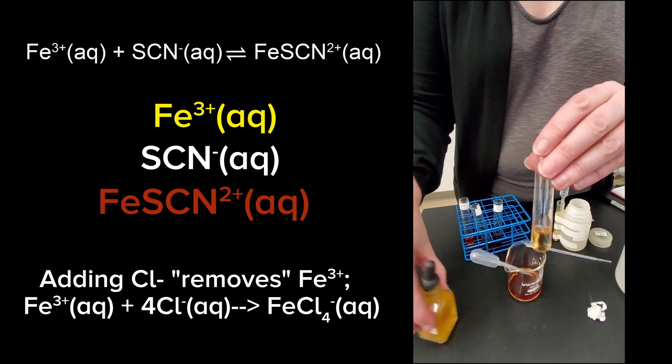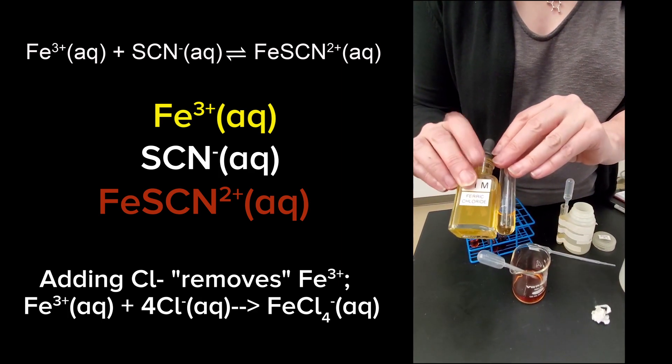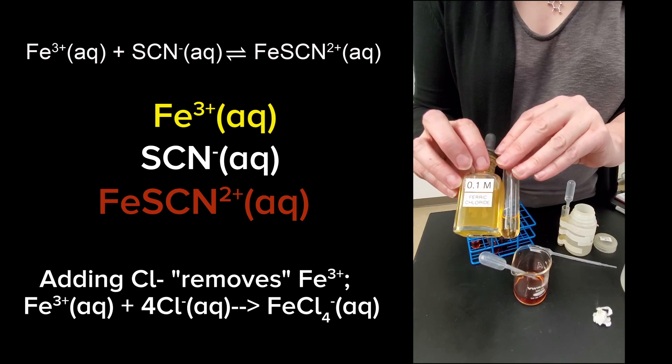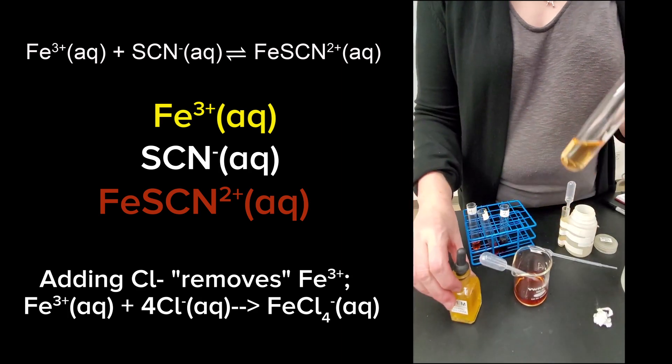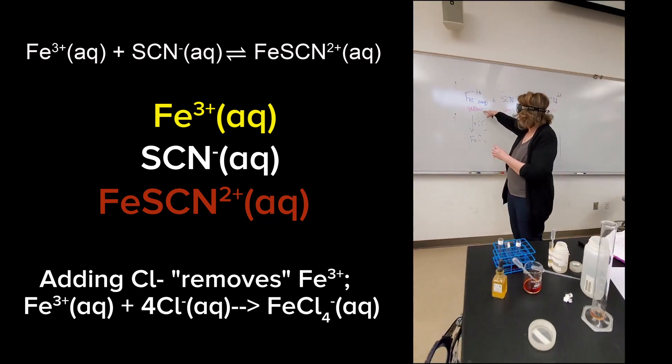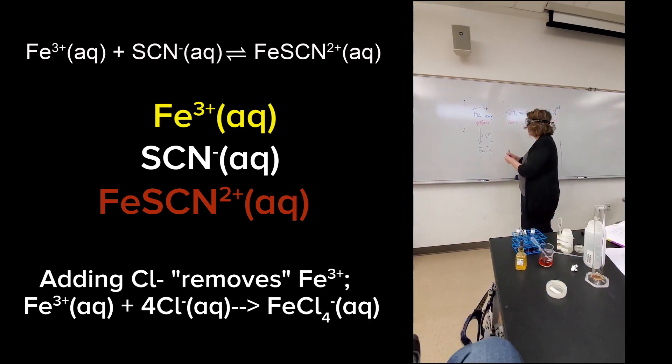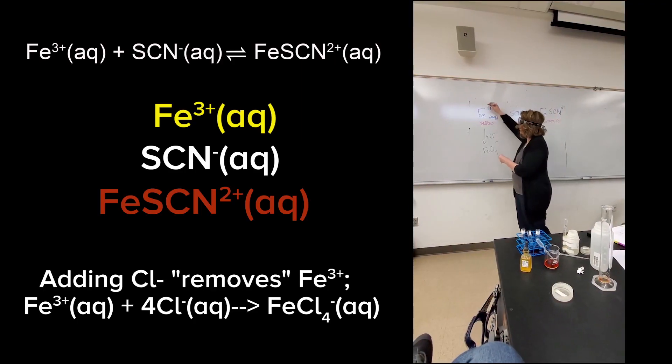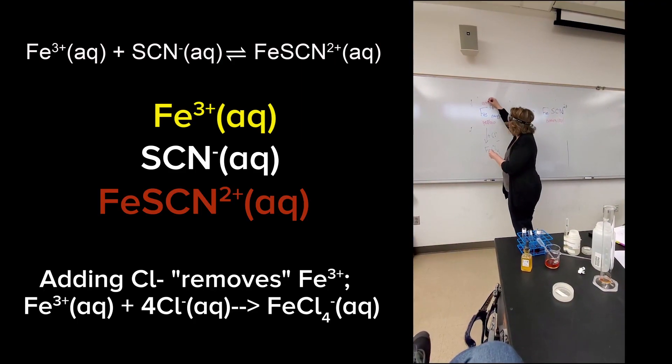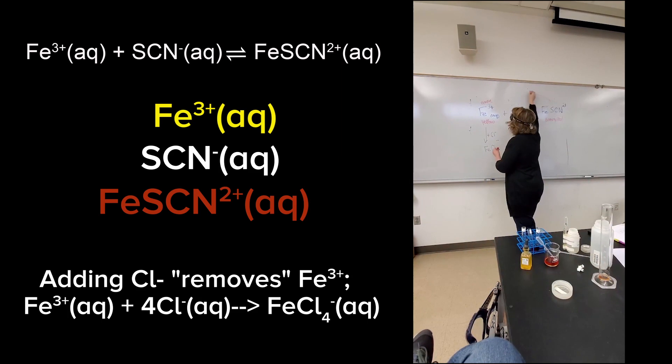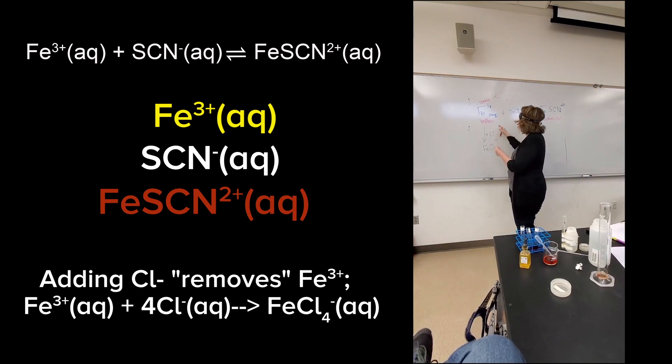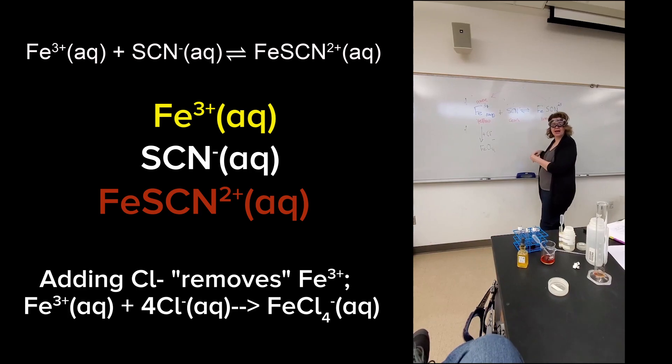And in fact, if I compare it, we're getting very close to the original ferric without any thiocyanate. So adding that chloride removes the iron. It's effectively removing this. So we get a shift to the left to replace it, which makes the brown color go away.